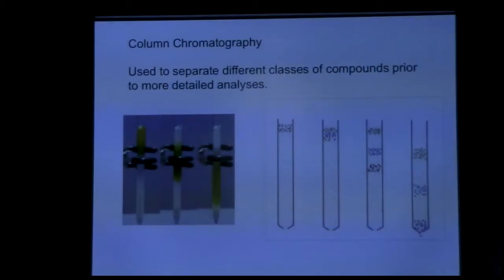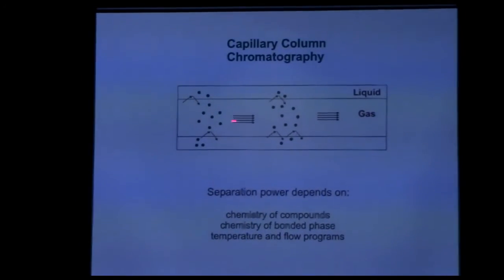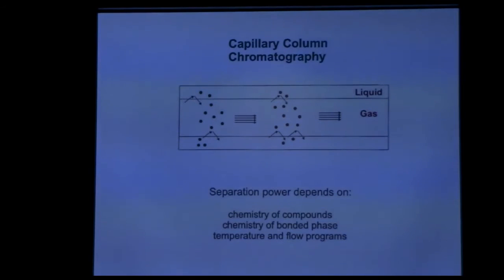Molecules interact with that stationary phase. Remember that little liquid coating on the inside of the tube. And we're kind of heating it up gently, so the boiling point is helping us with the separation. And they get into that carrier phase, and they move. Compounds with a stronger affinity for the stationary phase will stay put. Things that are more volatile and have lower chemical affinity for the stationary phase will move through more quickly. And so you can play with physical properties like boiling point and chemical properties like affinity for the phase to tailor and improve your separation. Here's another cross-section. This is a longitudinal cross-section of a GC column just to illustrate this a little bit more. You have the compounds in the gas phase are going to move. The compounds that sit down, and this is not to scale, but that really thin layer of liquid on the inside of the tube, and they will sit down in that and sort of hang out. And then they're actually kind of moving back and forth between these two phases. Continuously, and the more time they spend in the gas phase, the faster they're moving. The more time they spend in the liquid phase, the more slowly they're moving.